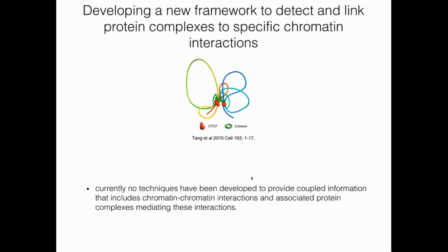So our overall goal is to develop this new framework, which I gave you a sneak peek on the slide before, to detect and link these protein complexes to specific chromatin interactions. And so we propose an integrated analysis for the simultaneous detection of protein complexes and the genome-wide chromatin interactions mediated by these complexes.